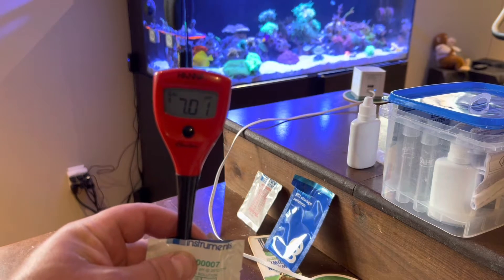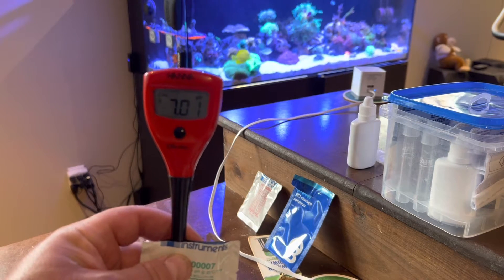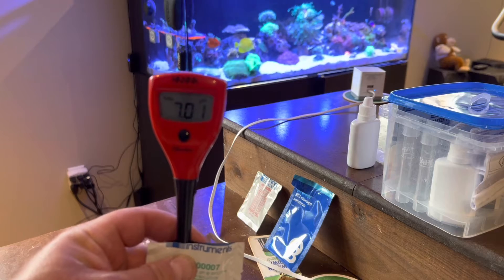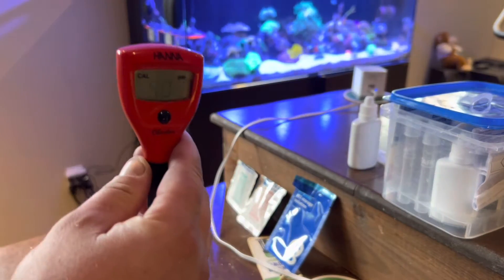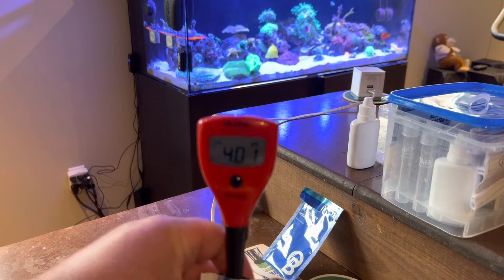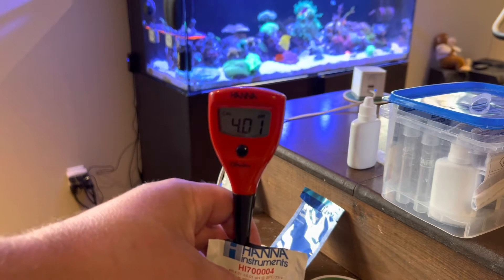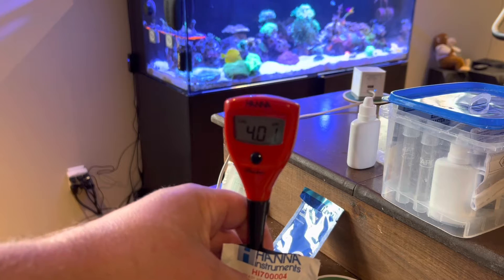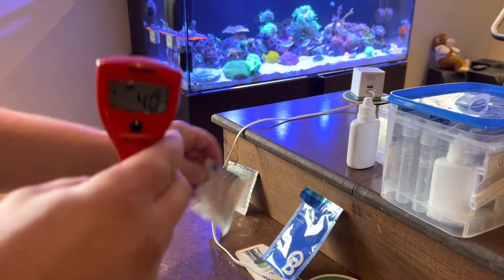I just calibrated this yesterday because I got it yesterday, so this solution should be fine. The hourglass is going to flash, and when it's done — remember, the first one it wants is seven. Now it flashes four, so we're going to go into the four solution. Same thing, it's going to flash. Hannahs are so good when it comes to this kind of thing. We have a two-point calibration, which is better than one. Now it says 'stored' — same as the salinity pen. Rock and roll, we are ready.